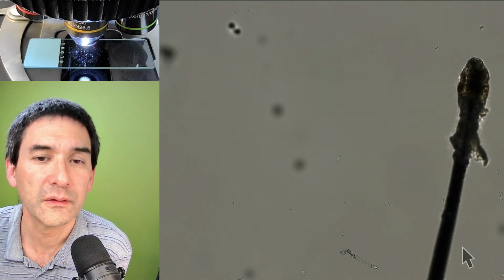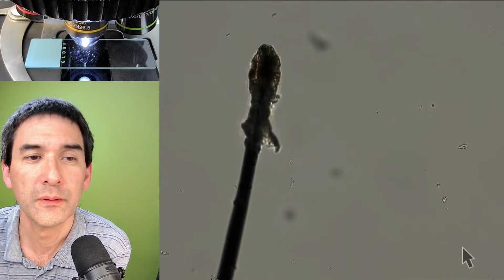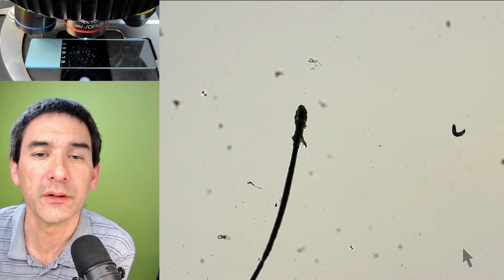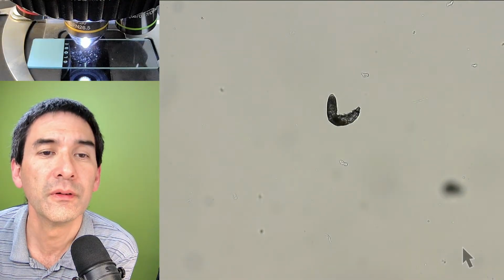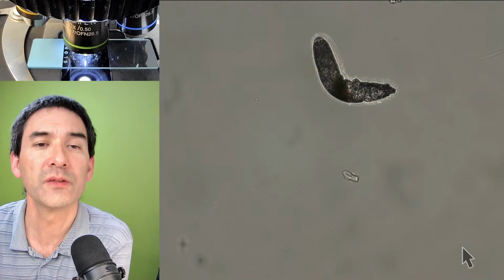Is this the one, the dead one from before? Okay, let me have a look at the low power. Here is one. Let's have a look if this one is still alive. Oh, it's still moving. Okay, this one is still fine.